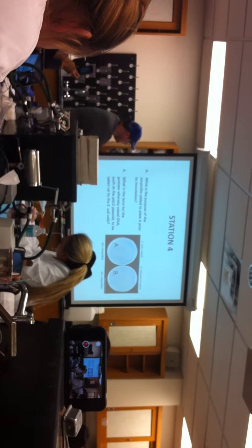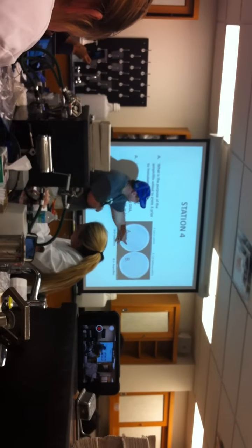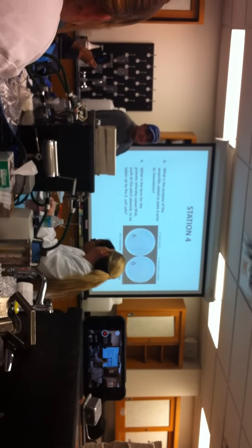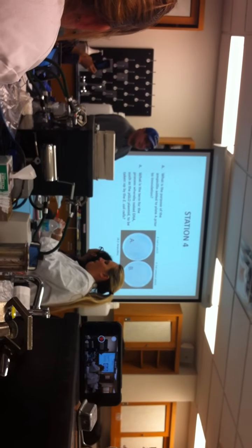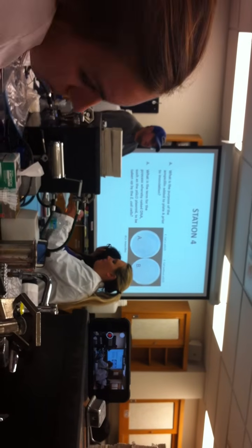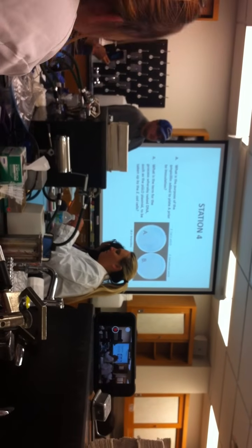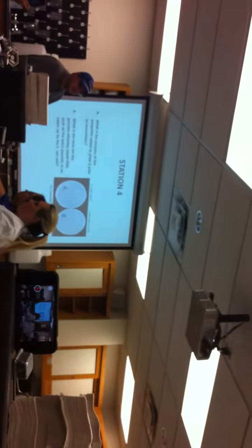Now, I guess you guys can't see that, but there's a lot of colonies on this plate. Sometimes you get green and white colonies. Can you guys guess why you get both green and white colonies? Not so much? Well, on the pGLO you have antibiotic resistance, right?